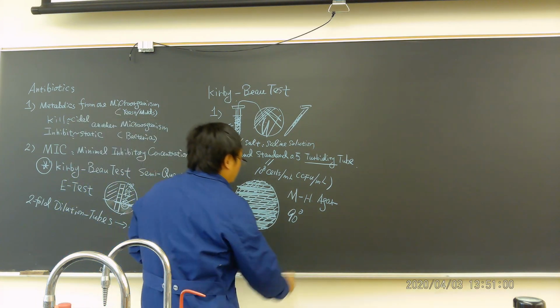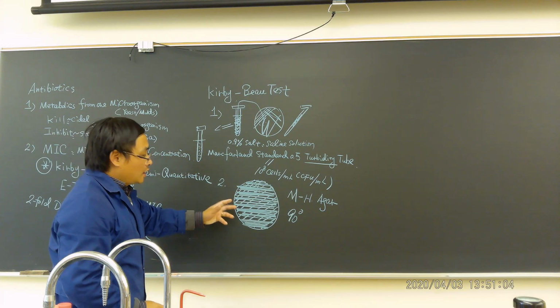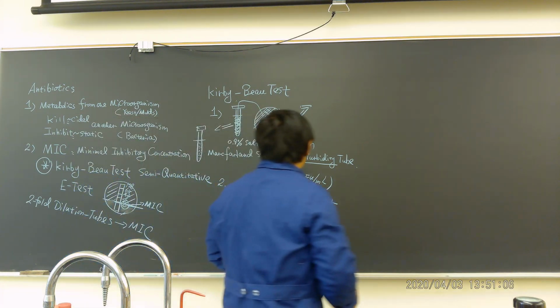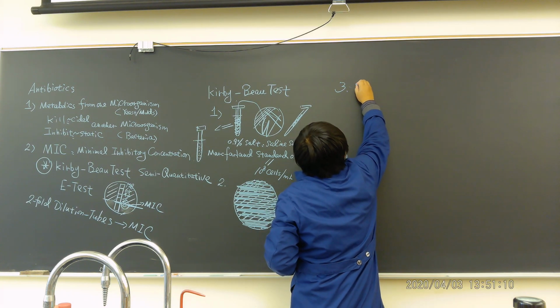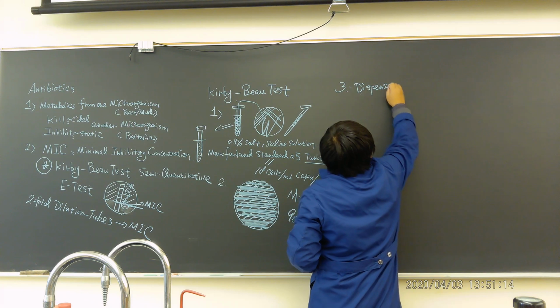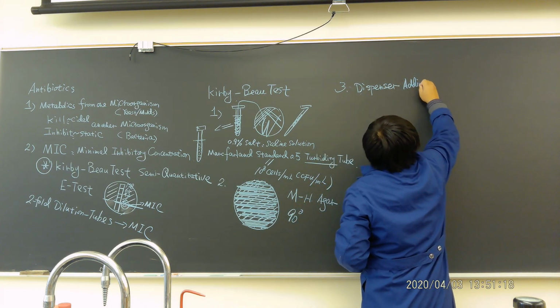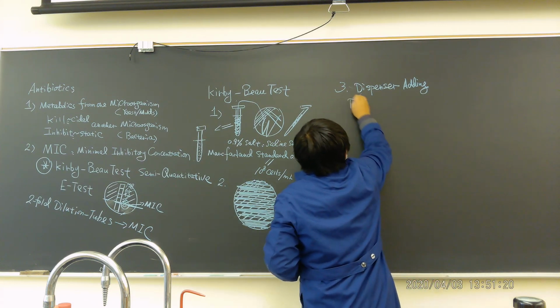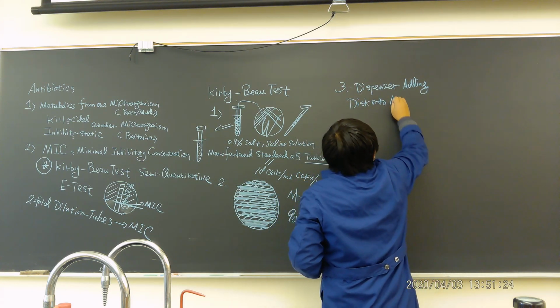Okay. Then we put the bacteria there. Now what we have to do is use the dispenser, adding discs onto the agar surface.